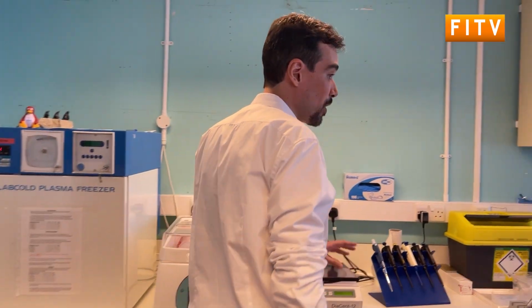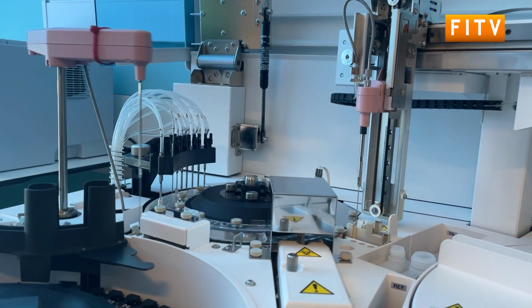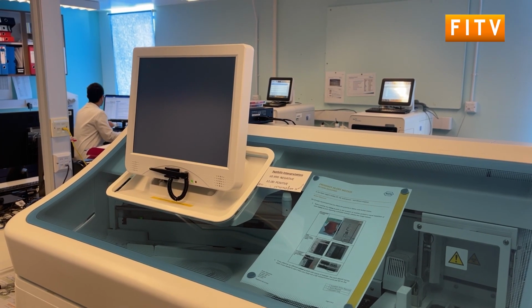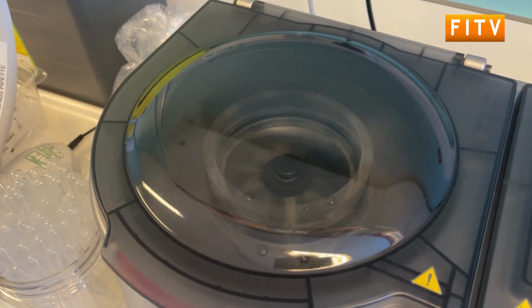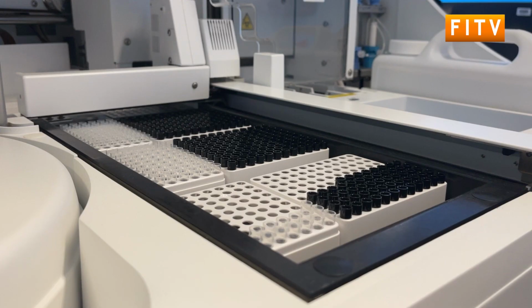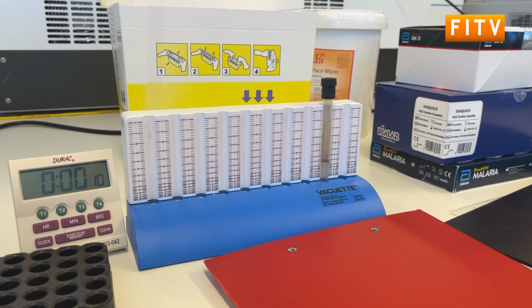So the lab is split up between 4 clinical scientists. We have a haematologist, a biochemist, 2 microbiologists, and that's the clinical side. Then we have the food and water side, which is just Tom, 1 food and water scientist, and we have 2 support staff that split themselves across the 2 areas. We do try and train up our microbiologists, because the skill set between food and water and microbiology are very similar, to double up as a backup for Tom when he goes on annual leave. So our team is 7 people. Ideally we would have more, but obviously there are limitations in size and budgets.